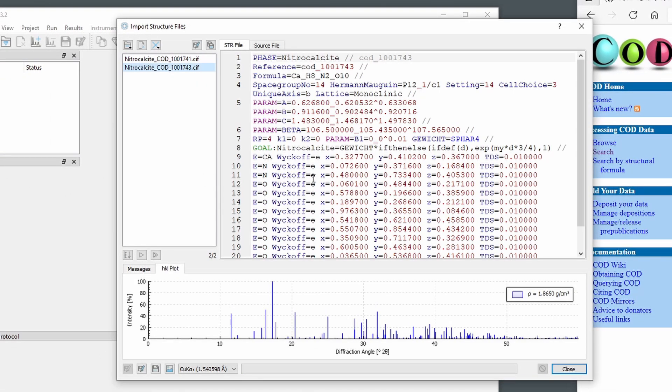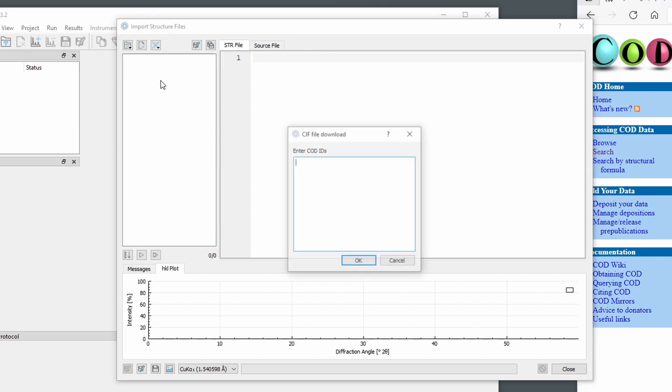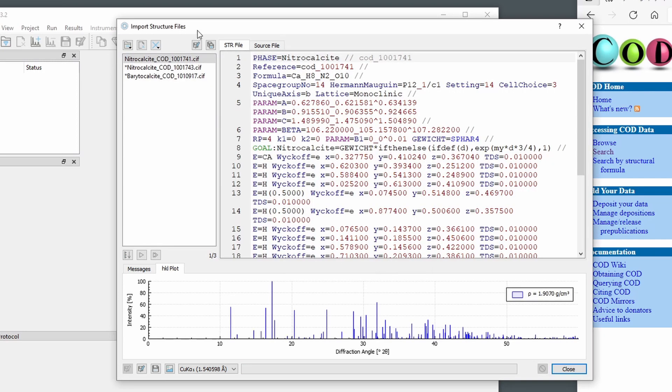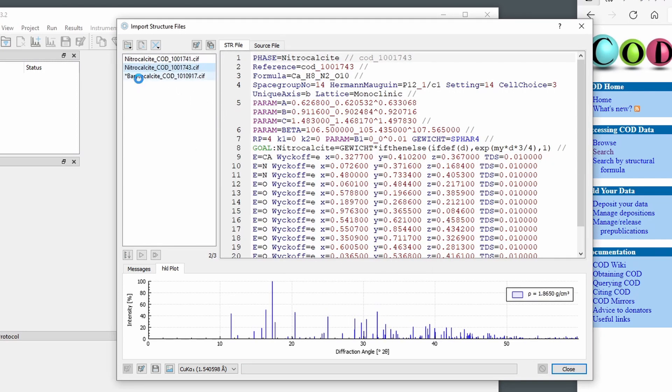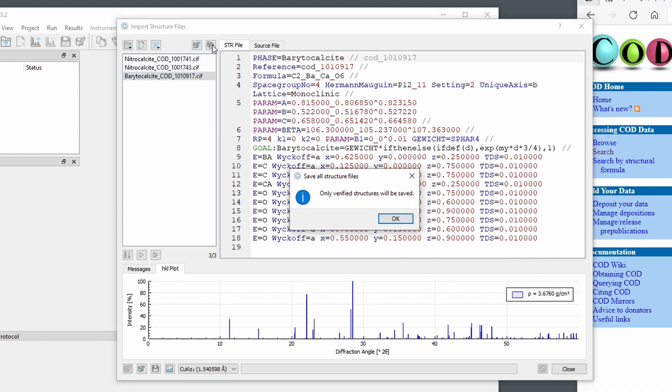There's actually even a faster way to do the same. We can even bypass the search dialog and go to enter COD IDs. And then we get just a text field. And we again enter all the IDs we want to download, separated by space or by new line. And it will download the CIF files directly and convert to BGMN structure file format and verify. And then we can just save all of them.